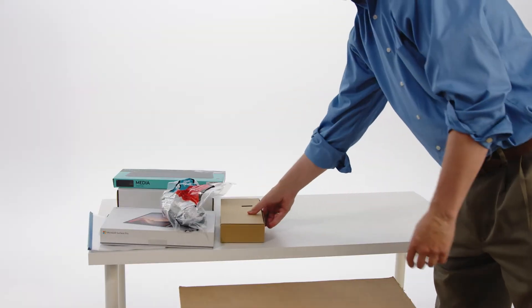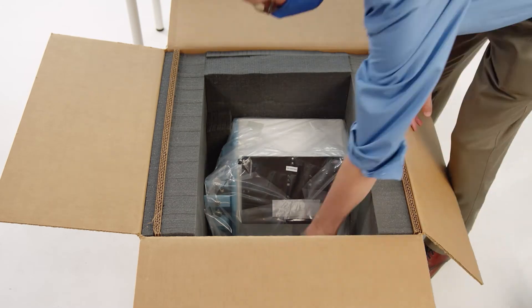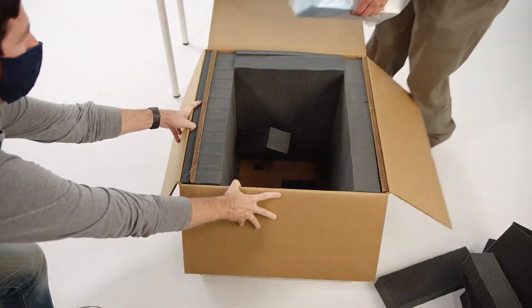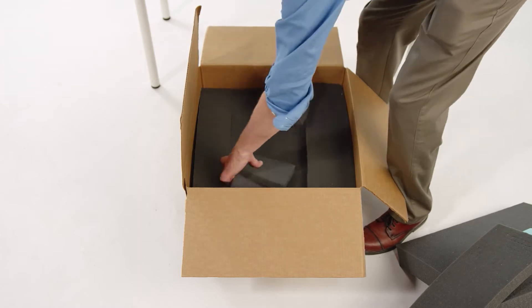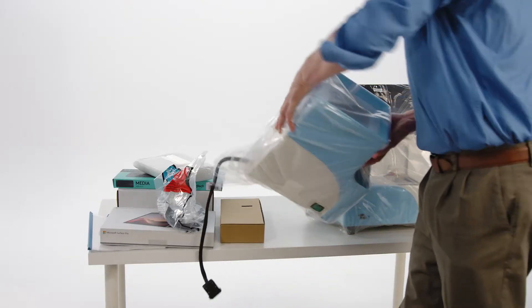Remove the remaining packing foam from box number one and remove the Singulator from the shipping container. The instrument weighs around 30 pounds, so we recommend two people lift the instrument out of the box. Place on the lab bench. Remove the reagent chiller from box number two and place on the bench next to the left side of the Singulator.